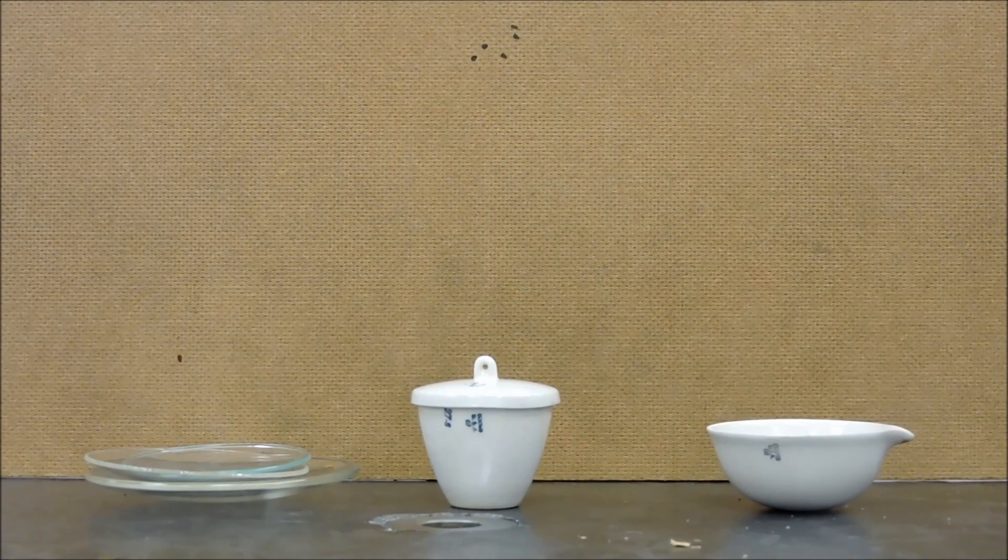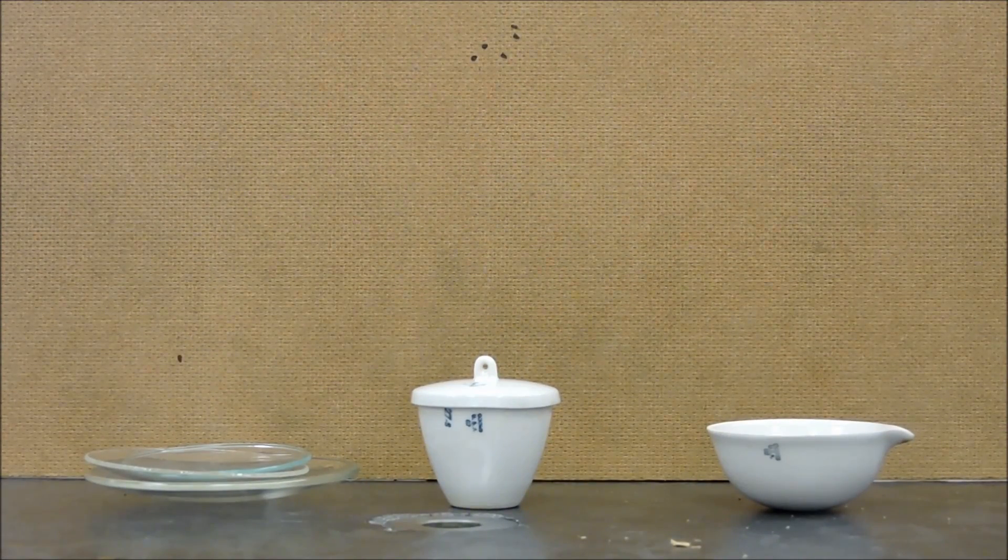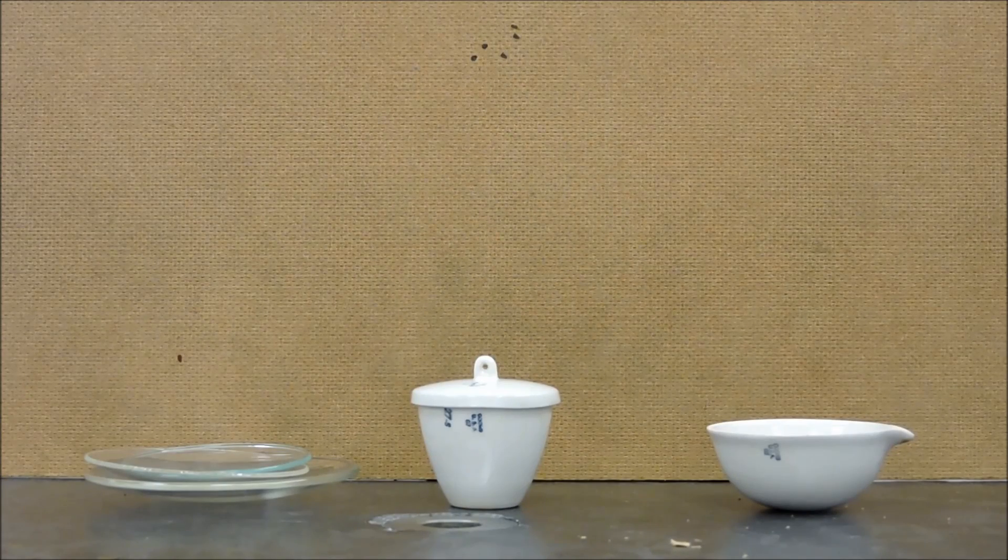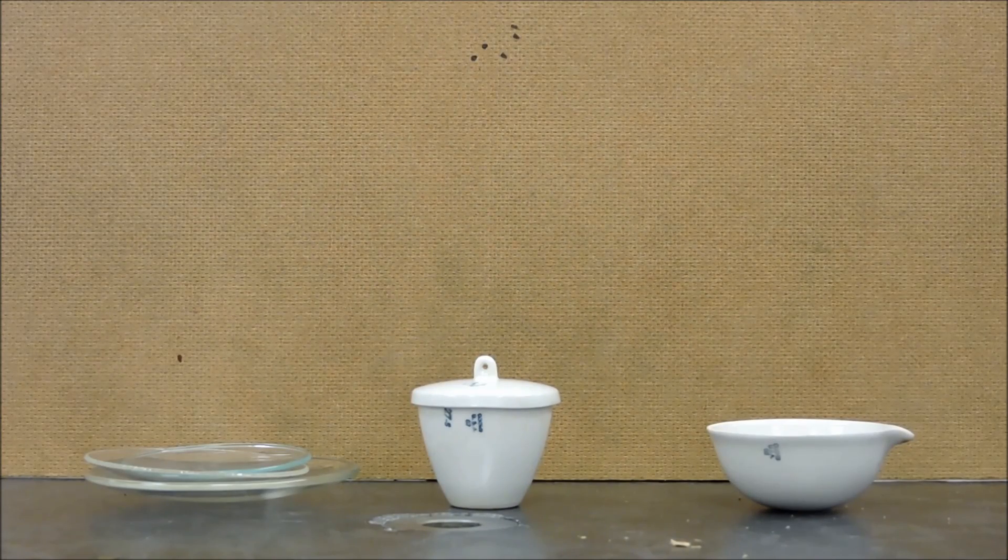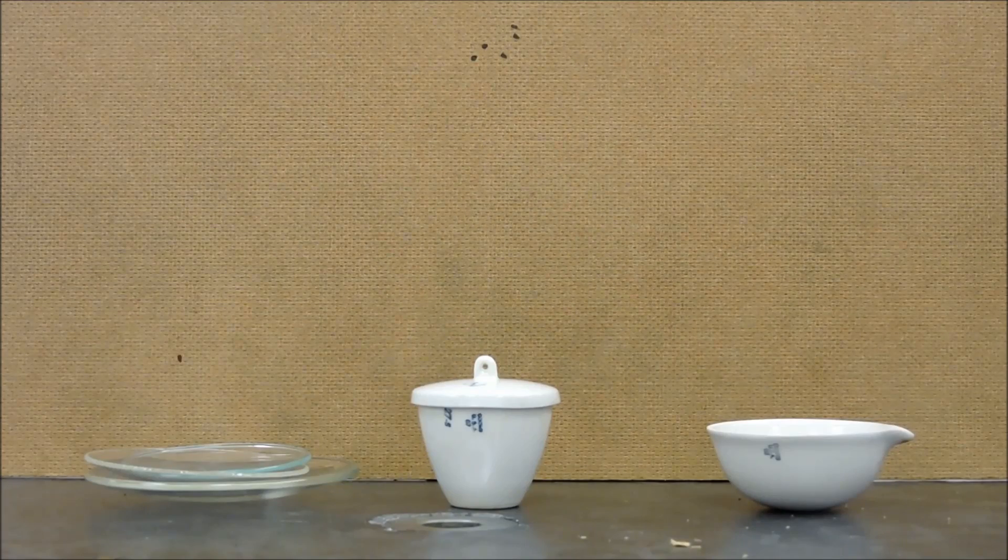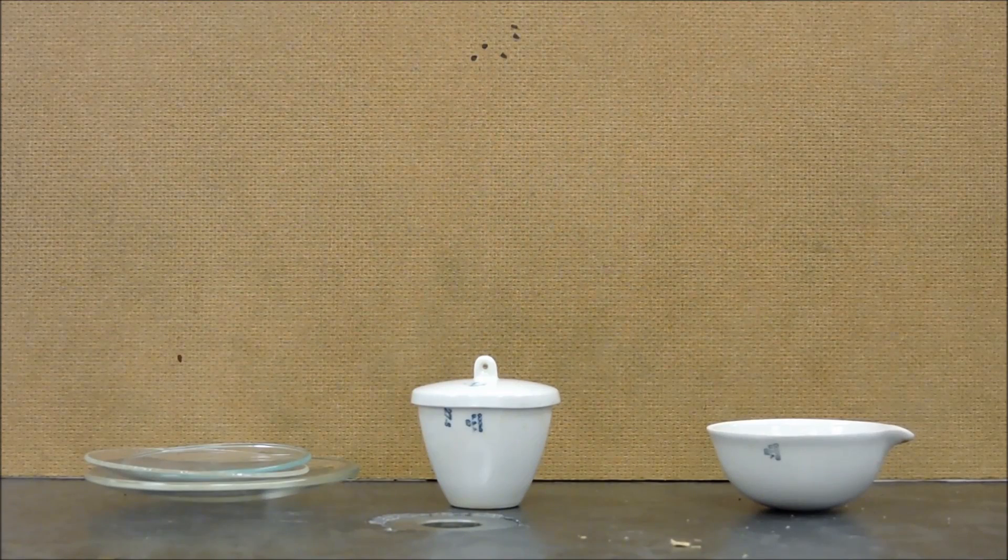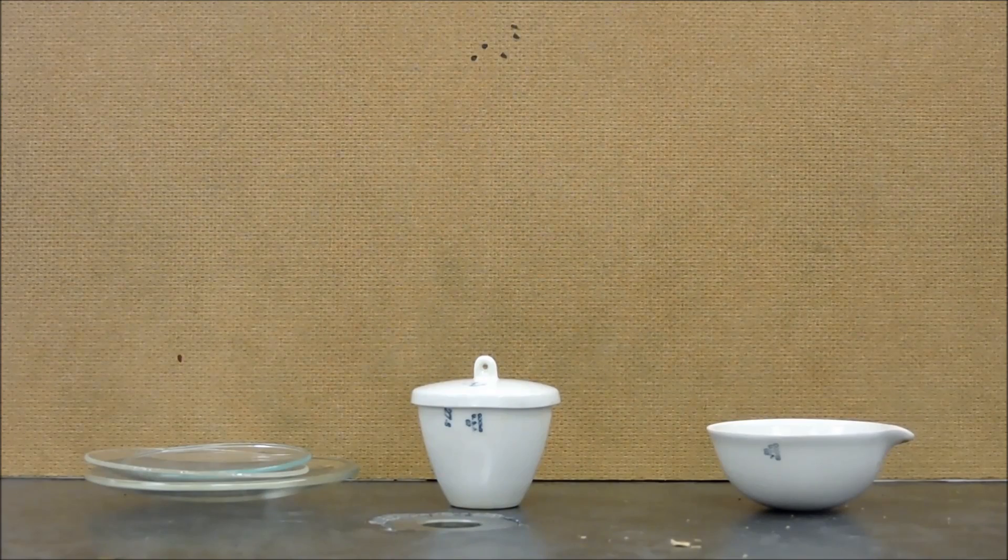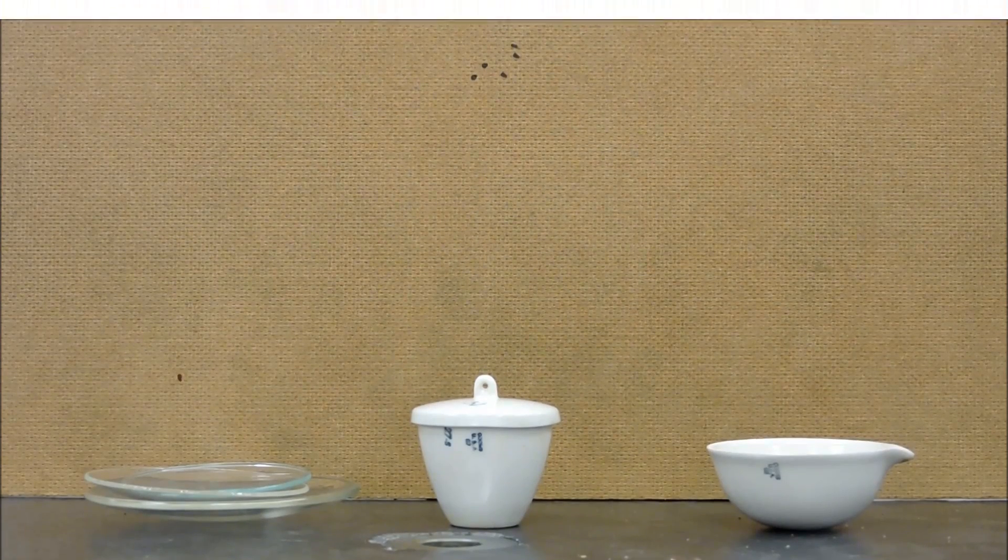The item to your left is a watch glass. It is used to observe substances. The item in the middle is a crucible and its lid. It is used to hold heated substances. You will use a crucible in the percent hydrate lab. The item to the right is an evaporating dish. It is used to observe evaporating substances.